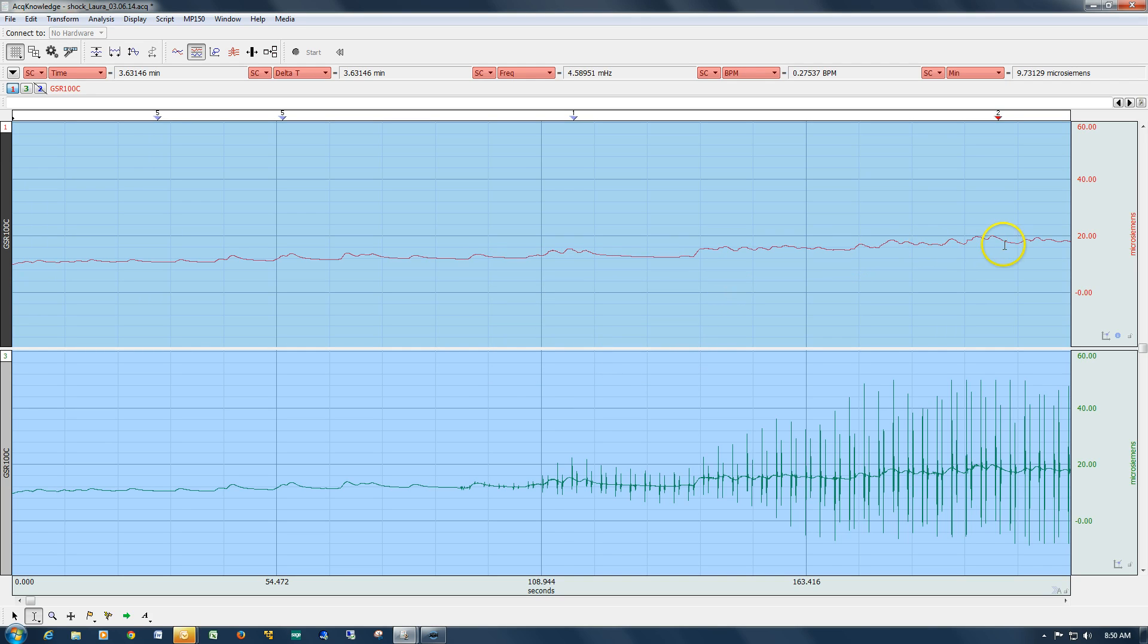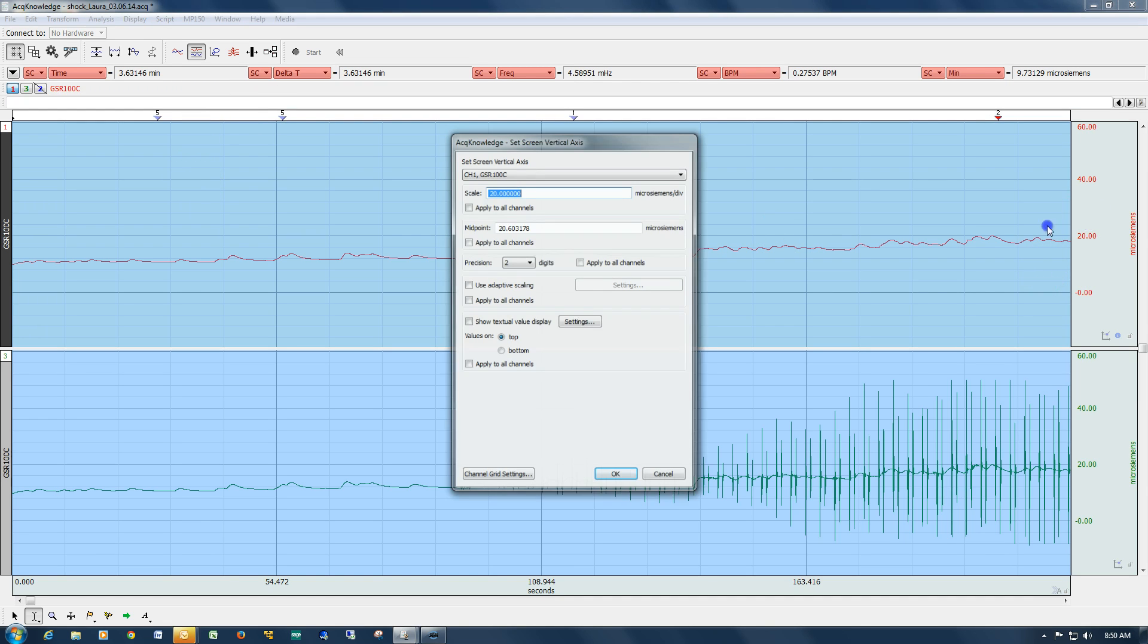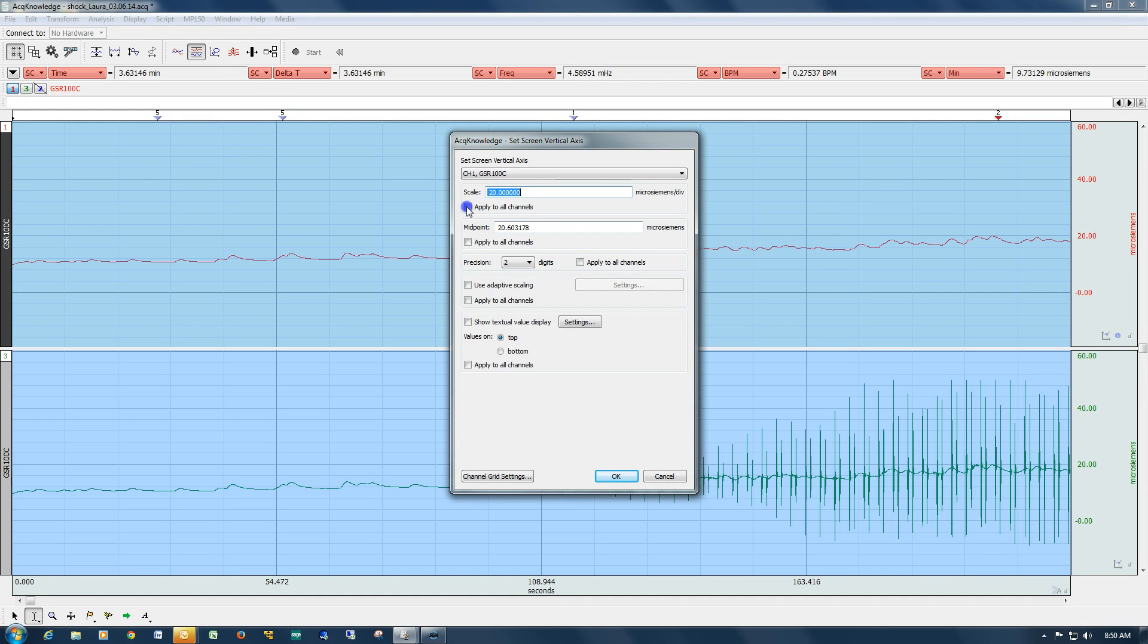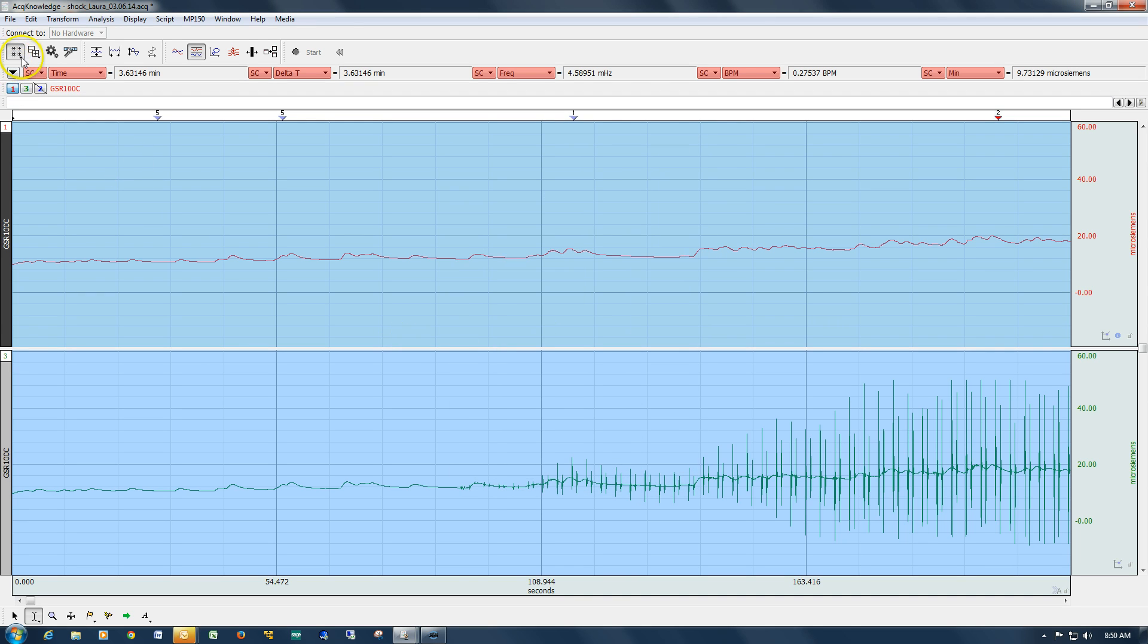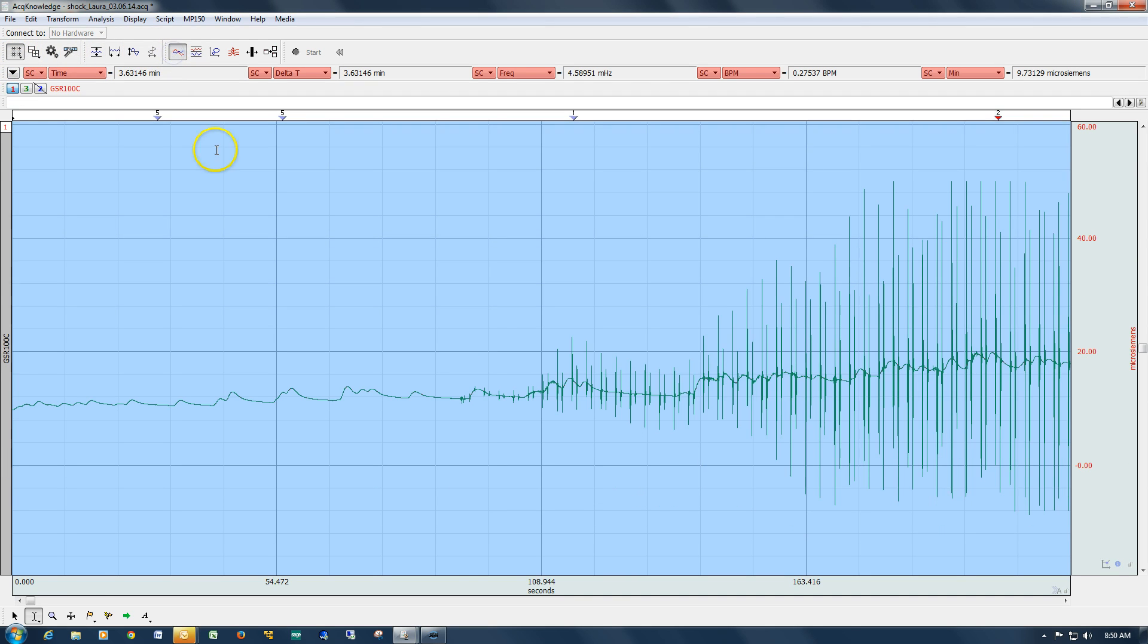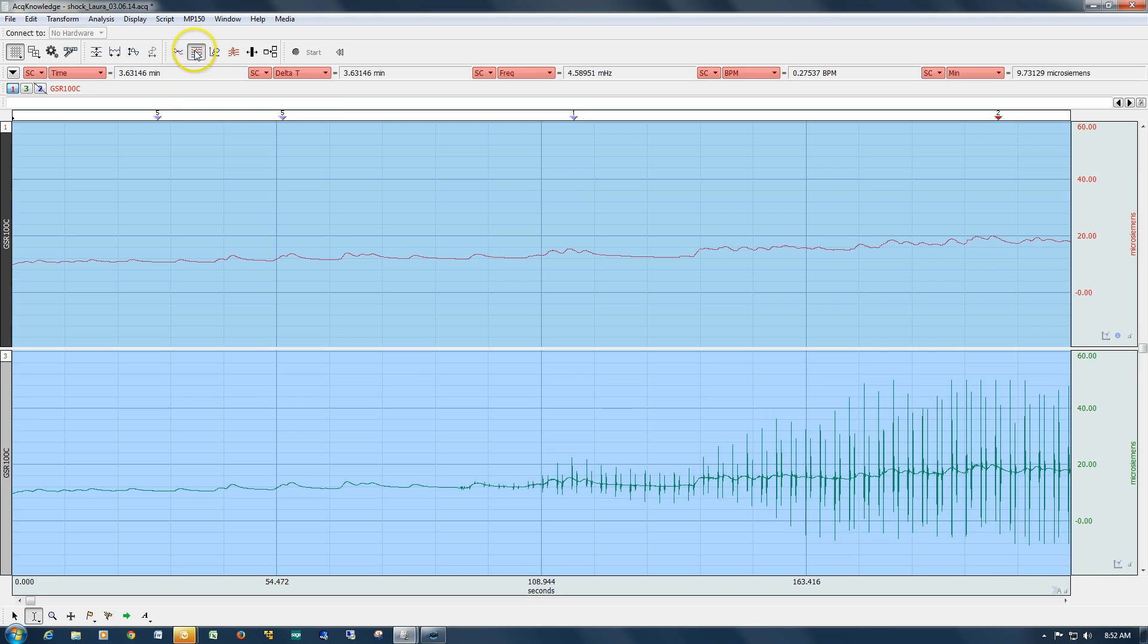You can see we've removed them, there's little evidence of them there. Again, if we scale these the same, overlap, and there's no evidence of signal distortion. That concludes this demonstration of the AcqKnowledge smoothing functionality.